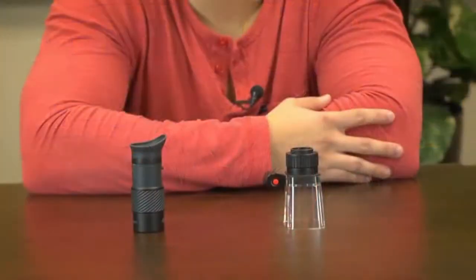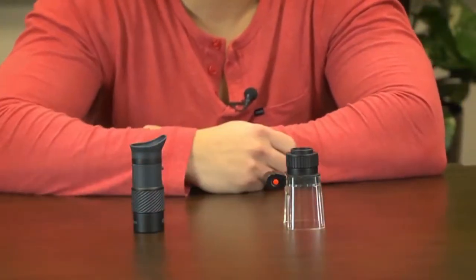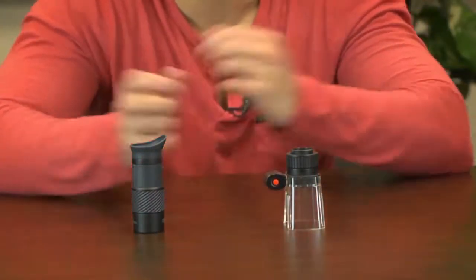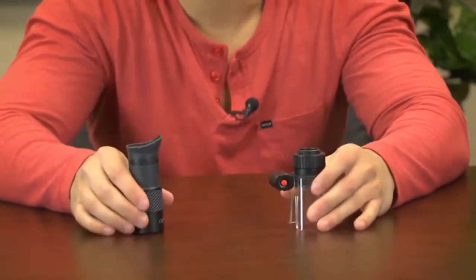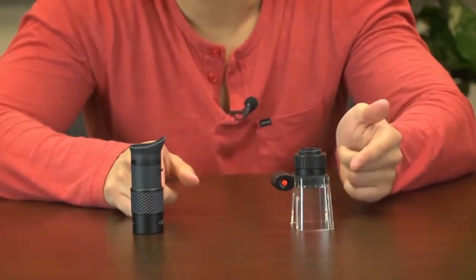Hey what's up guys, this is Doug from Carson and today we're gonna check out the Magniscope. Now this is one useful device, well actually it's three useful devices. That's right, the Magniscope is actually a 6 power monocular, a 4 power eye loop, and a 25 power microscope.